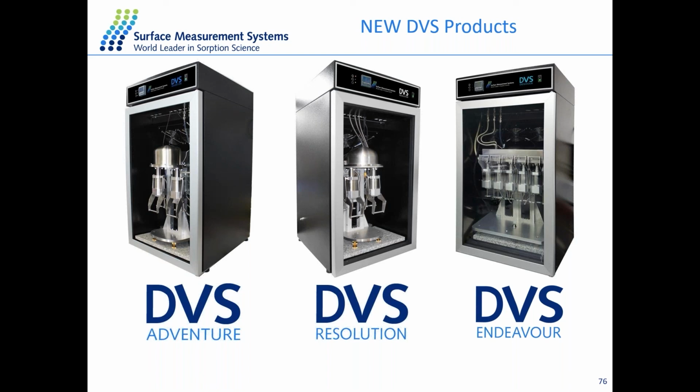All the data that I showed you today were collected in one of these three instruments, which are fairly similar in structure. We define them as Adventure, Resolution, and Endeavor. The difference in the instrumentation is related to the difference in capacity of what the system can do. So a DVS Adventure can run experiments only in water. A DVS Resolution can run experiments in water and or organic solvents. So the latest set of data was run on a Resolution.